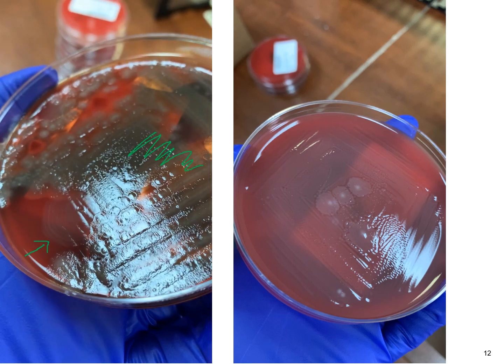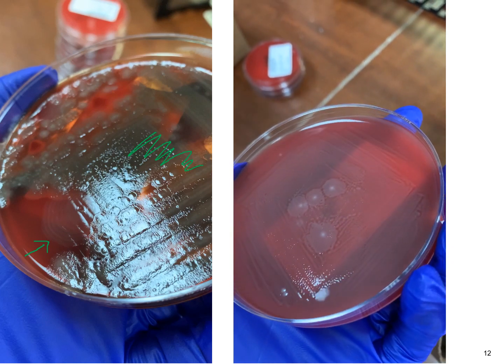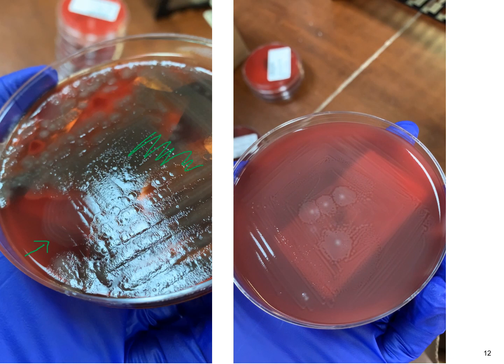And then that other organism, you really can't see that metallic sheen very well on this particular plate with this particular organism. And then this plate beside it on the MacConkey, you can see that swarming as well. And so this morphology would be considered swarming.